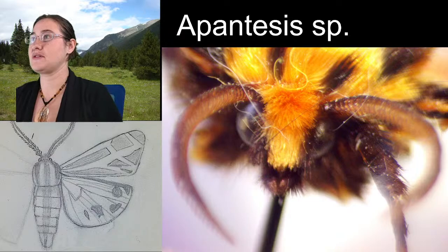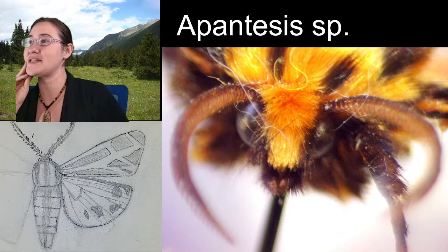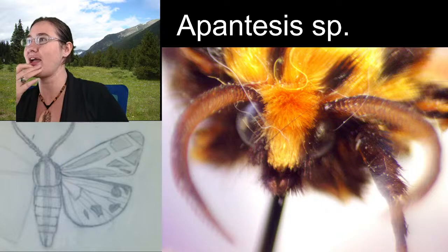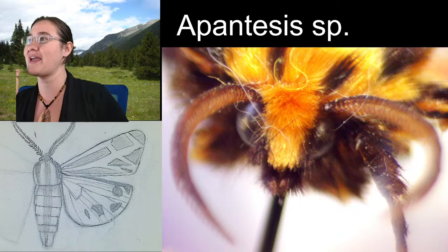I haven't confirmed this identification because there are a whole bunch of Apantesis moths that live in Michigan, and they all have the same zebra striping on the front wing and then the bright red. Some of them have yellow on the hind wing, so some are easy to rule out. But because there are so many, and I can't guarantee that iNaturalist has them all, I'm not super comfortable identifying this guy just based on pictures.